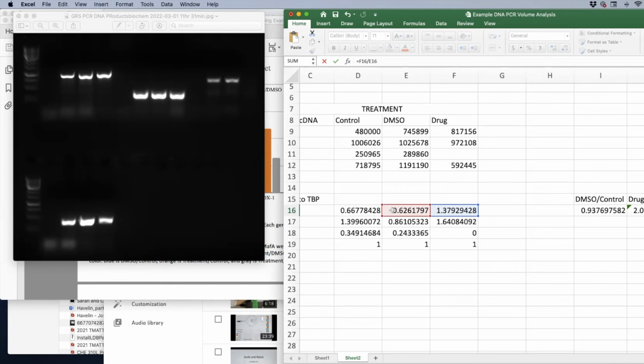Can you shoot me an email with the gene that you're missing? Okay. And if we're all lucky, someone else may have run that gene, and maybe I can give you that data. I mean, the alternative is basically rerunning these.